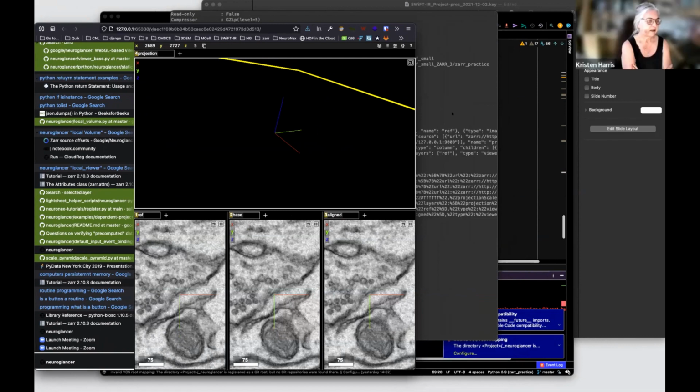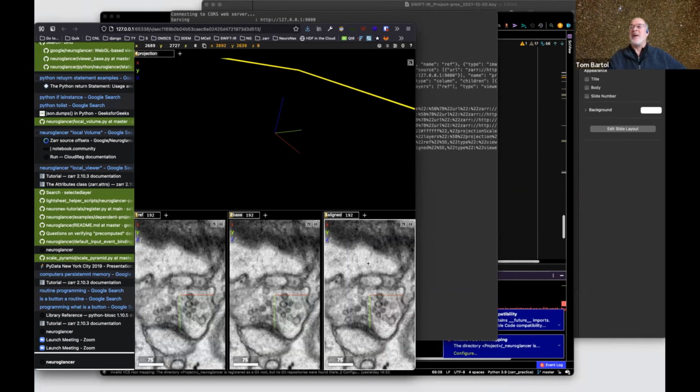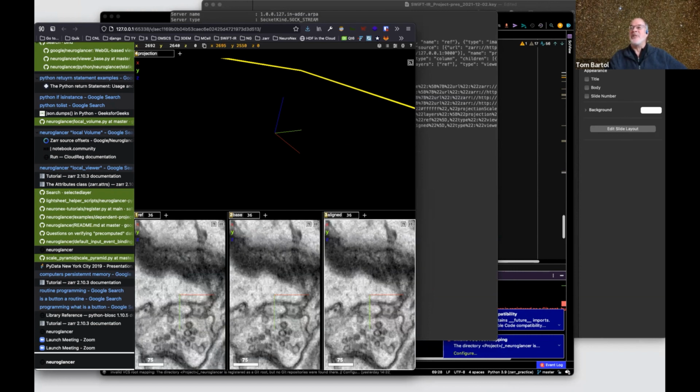That's right. Okay, so what you've done, which looks great, is that you've basically replicated what Tom and Art and Bob had done before as a standalone, and it is now operating within NeuroGlancer, correct? Yeah, just the look so far. Right. And next steps are to design some functions and buttons to carry out the procedures.